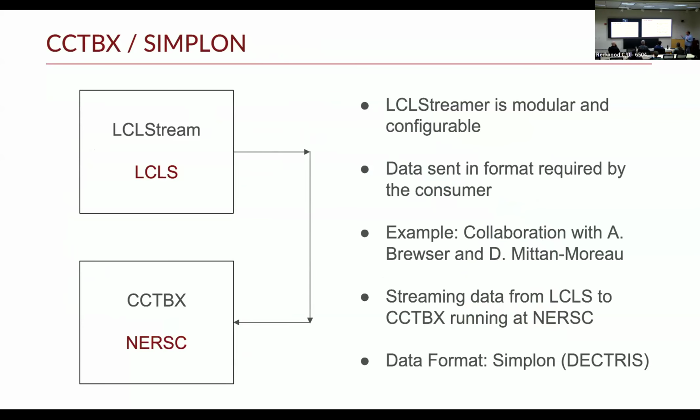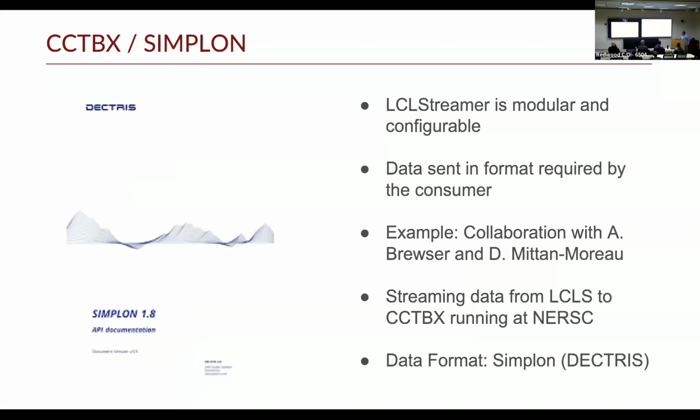We started working with David, Aaron Brewster, and Nick's team with the idea of plugging into the infrastructure that they already have, where they get the data from the synchrotron, so that we stream the data from LCLS looking almost exactly with the same format, so that we can go directly in their pipeline. And we are working with them at this time to make this true. Yeah, this format from the synchrotron is very well documented and defined, and we are trying to make the data that come out of LCLS follow this.